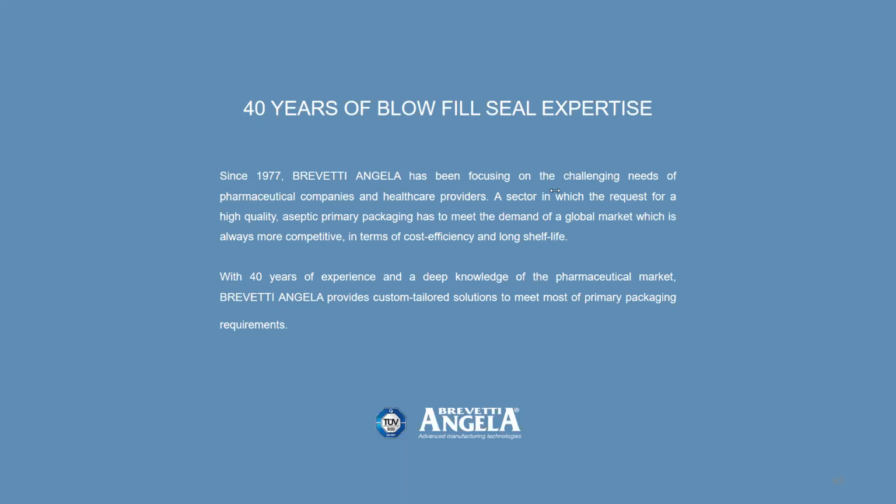Okay, so the following one will be how long the typical stability testing would take. If you carry out an accelerated stability study, about 3 months, and if you carry out a full stability study, it would take about a year.